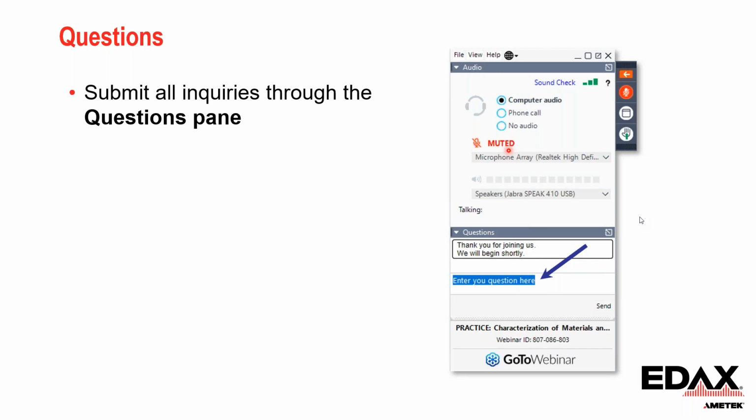So basically we have no lithium to analyze. For example, lithium metal oxides are one of the primary reasons to be interested in lithium detection, but no lithium X-rays have ever been detected from this group of samples.